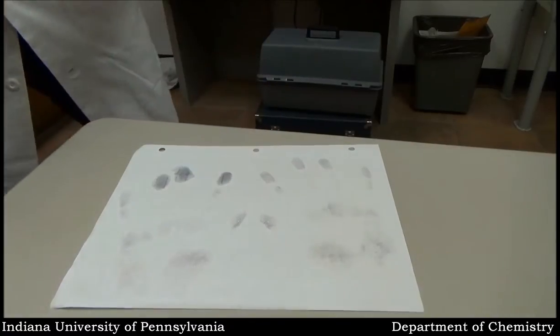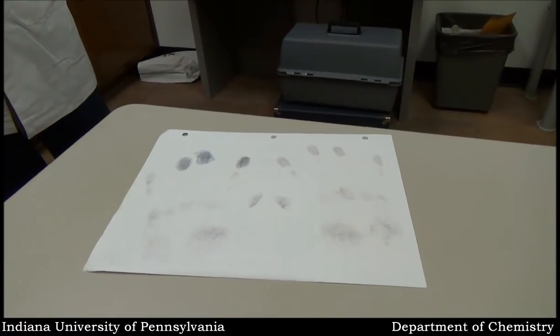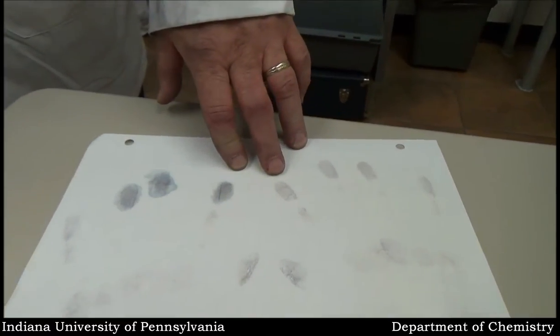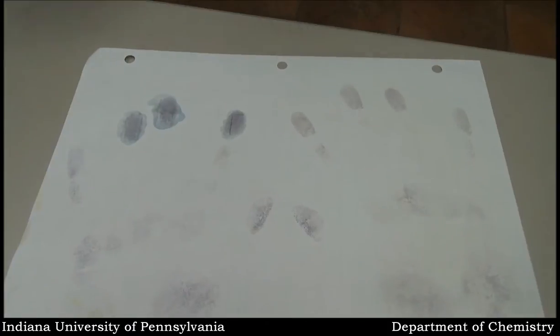Let that sit there for a few minutes and you'll see as it dries, it'll darken those latent prints. Meanwhile, the unfixed ones — the longer they sit here, the more they will fade from the iodine fuming.